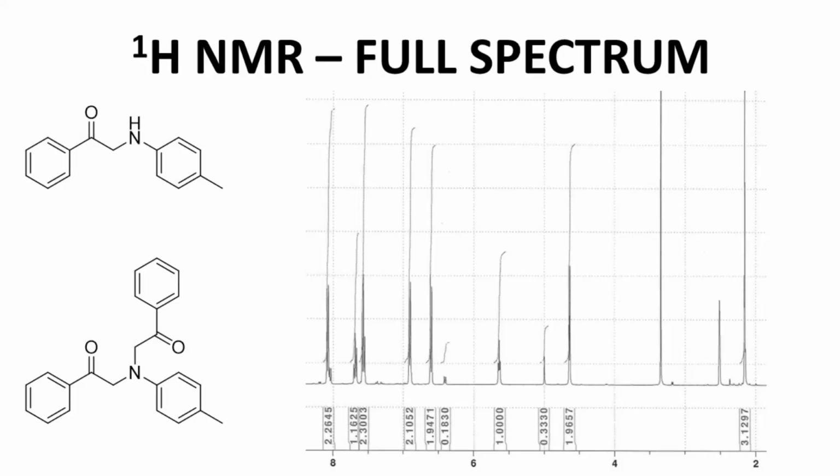Let's go back to the spectrum slide. This peak is at 6.4 ppm. It's tiny. It's from the impurity alone. I believe this to be the aromatic hydrogens on the aniline ring closest to the nitrogen. Both hydrogens on either side of the nitrogen.